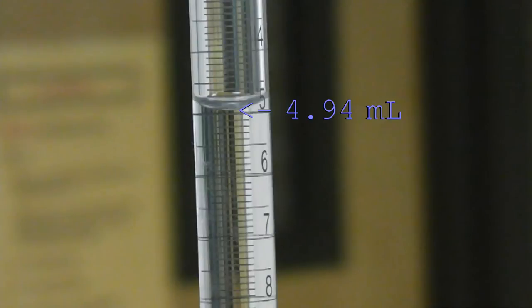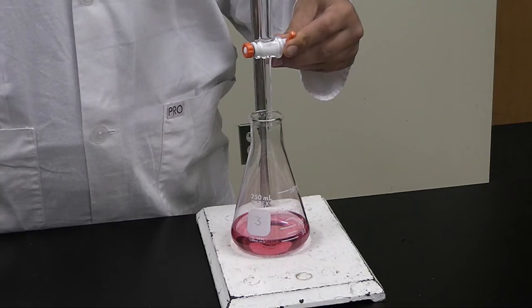Once you have done this, make sure that you take your initial reading of the burette, which in this case is 4.94 milliliters. You are then ready to begin your titration.